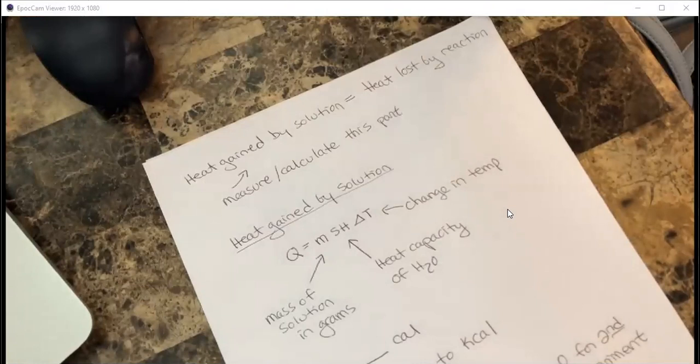So this is what I would have put on the board if we had been in lab. Heat gained by the solution is equal to heat lost by the reaction. That's what we're going to be measuring and calculating. For the heat gained by the solution, we have Q equals M times SH times change in temperature. The M is the mass of the solution in grams, the SH is the heat capacity of water, and the change in temperature is our T final minus T initial, like I showed you in the other one.